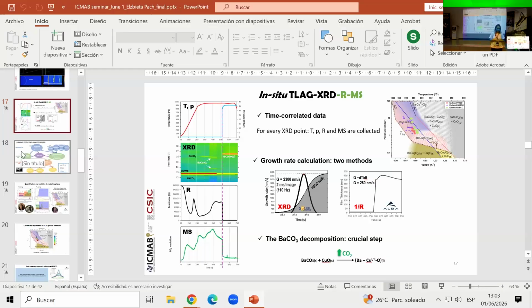Just a comment here. It's a good point, actually. It's a shame there's no electrochemist in the audience, but I guess it could be ionic current. The peak, you mean? Yeah. Because it could be ionic diffusion, right? But this is not in the liquid, it's before, it's the solid phase. It's the solid phase transformations.